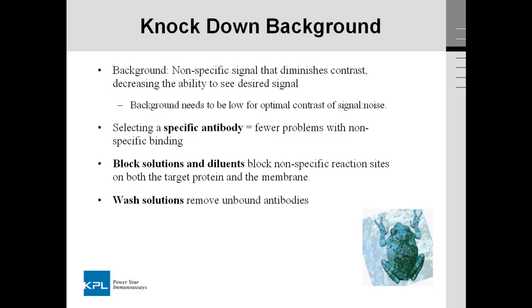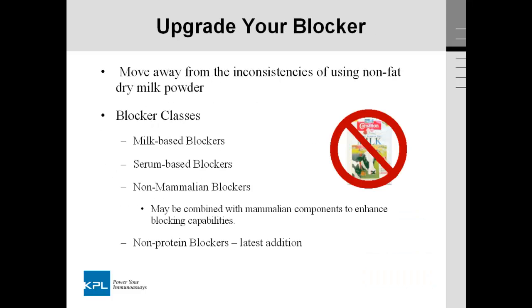Selecting a specific antibody will allow for fewer problems with nonspecific binding. Choosing the optimal block solution and diluent will help to block nonspecific reaction sites on both the target protein and the membrane. And wash solutions will help remove unbound antibodies, all of which may contribute to excess background.